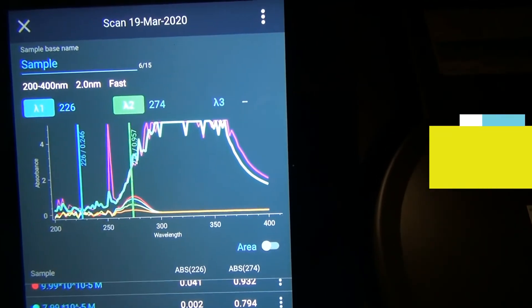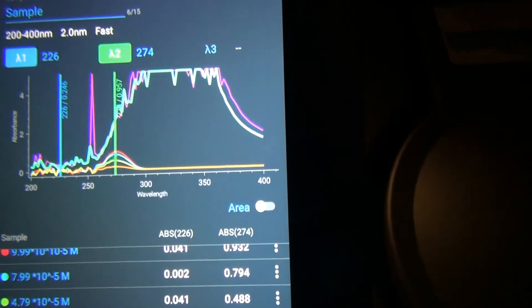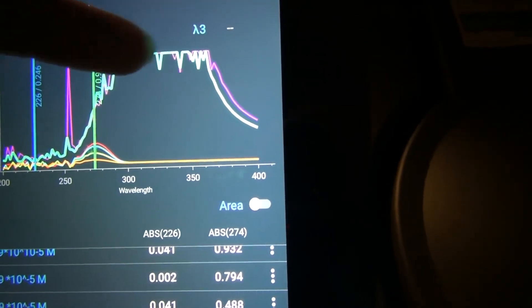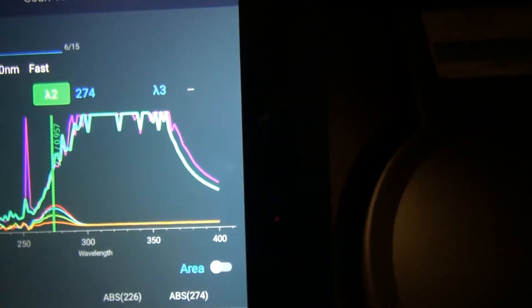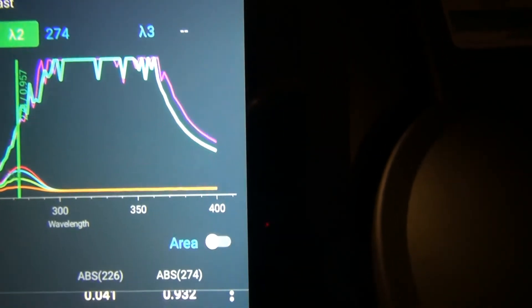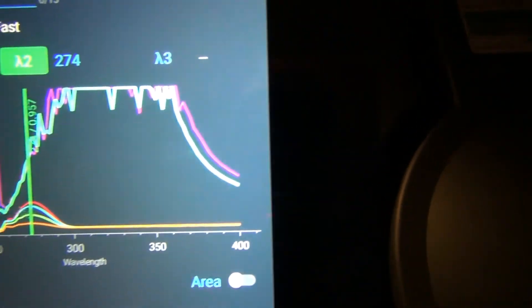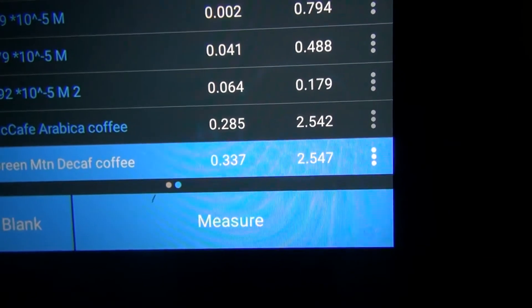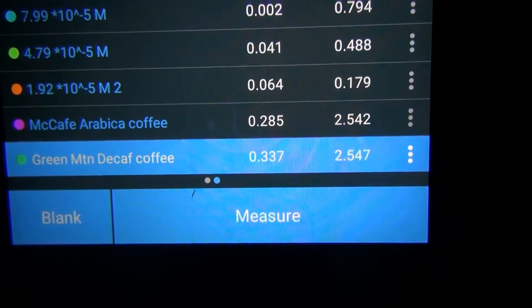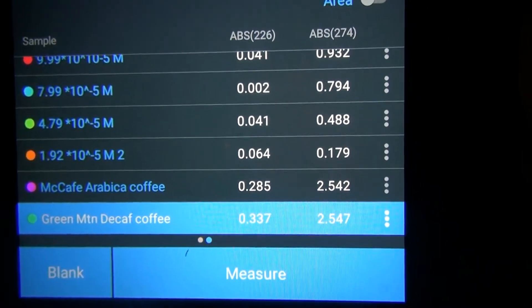The coffee samples have been run as well. The peaks at the top are the coffee samples — the purple line is the McCafe, and the second line, which looks orangish on the video screen, is the Green Mountain. The absorbance values for those samples are labeled here for you to record.